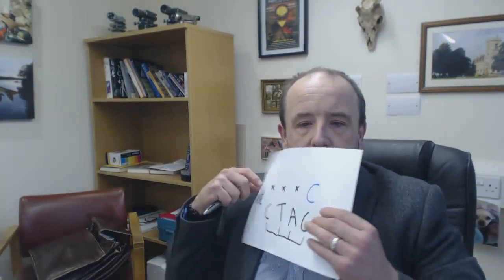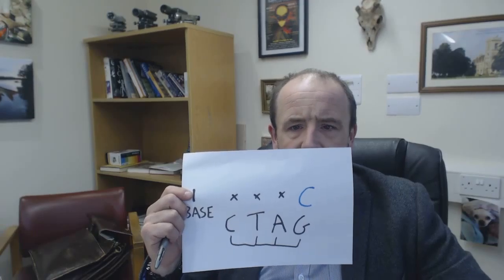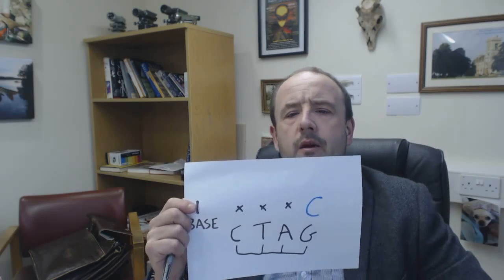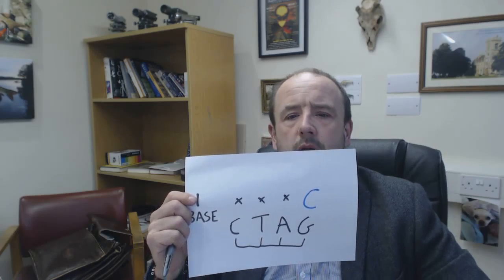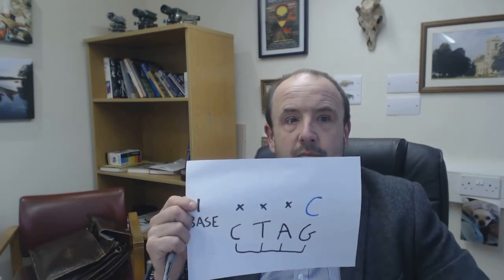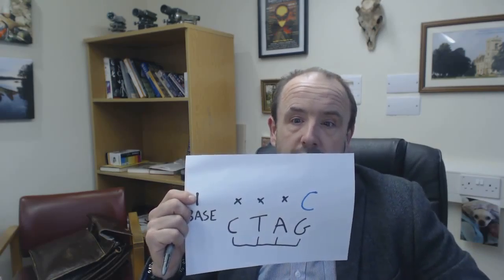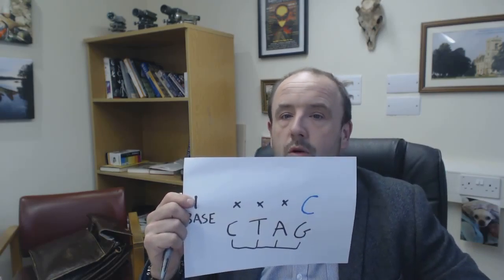So, for example, in the sequencing reaction, it's just like PCR, and in fact we have a single primer, whereas PCR has two primers, so that's a slight difference there. With the sequencing reaction, we have a single primer rather than a pair of primers, okay? And we have a mixture of both fluorescently labeled dideoxynucleotides and normally labeled deoxynucleotides, so normal A's, T's, C's, and G's.